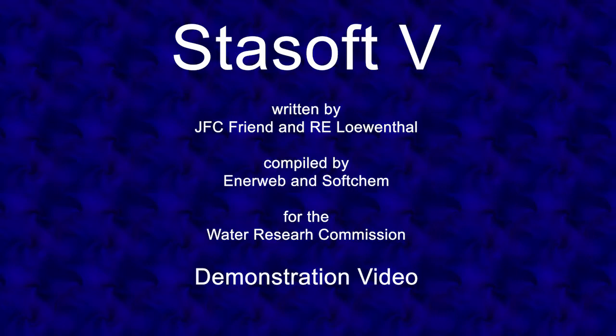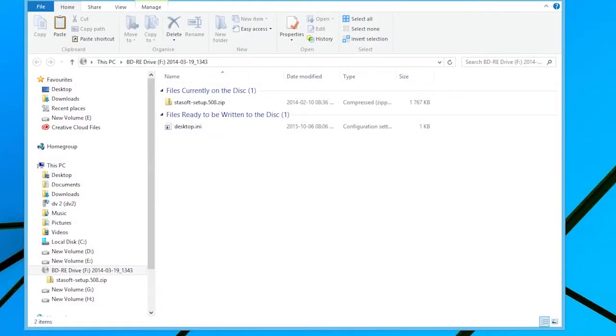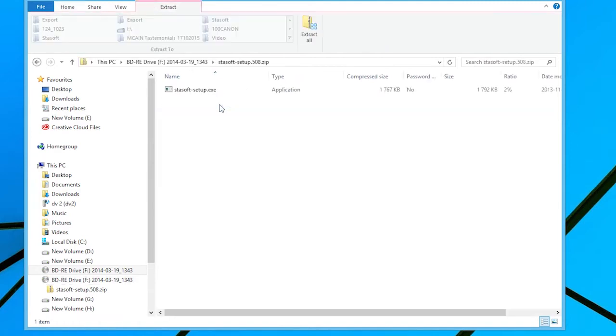The Stasoft 5 demonstration video. The Stasoft 5 software is distributed as a self-extracting file, namely stasoft-setup.exe.